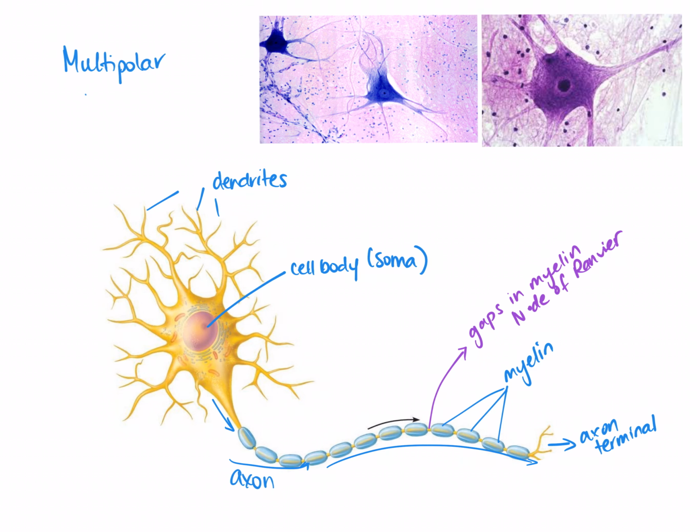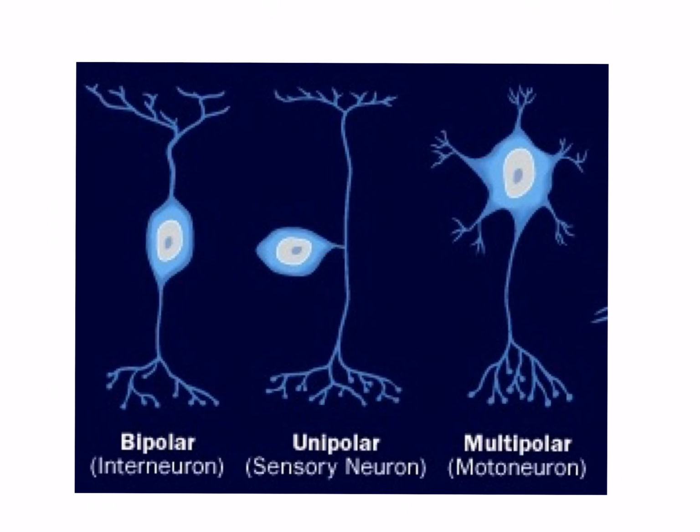And the reason that that's important is because we do have other types of neurons as well. Let's look at those in the next slide. So in the far right image here, we can see the same multipolar neuron that we just labelled before. Examples or situations where we'll find these multipolar neurons are in the motor system as motor neurons. The reason they're called multipolar neurons is because we've got multiple dendritic branches, as we can see, inputting into that one cell body, and we've got one axon then coming out of that cell body.